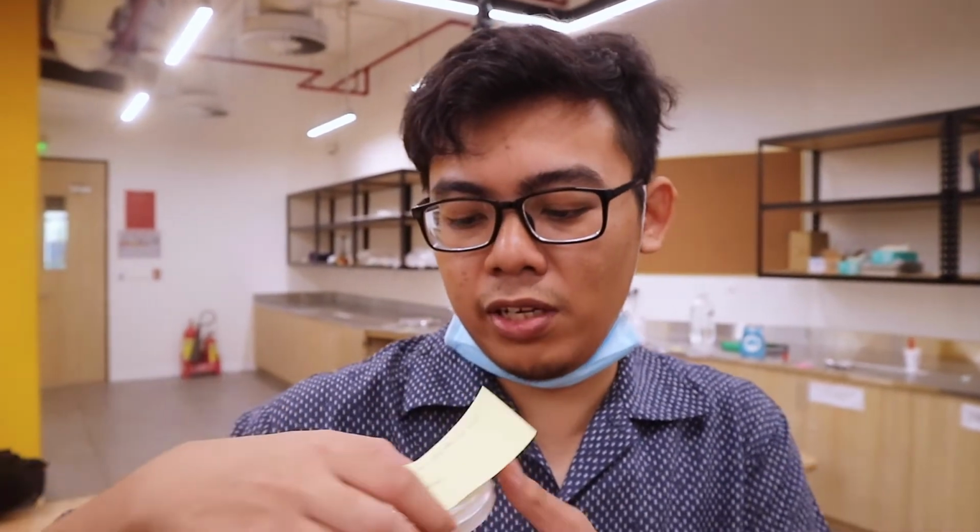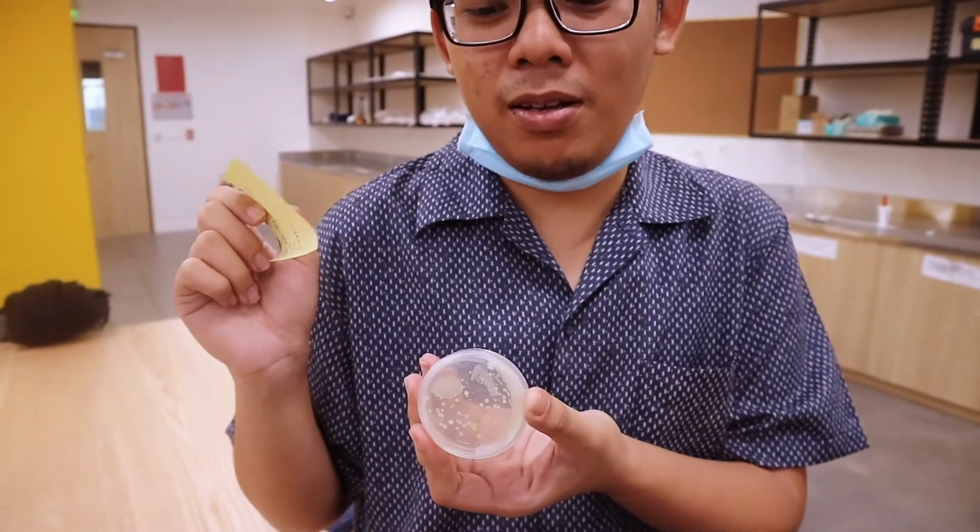May you summarize everything here? So another disclaimer is that we use a cotton swab to collect the samples, and maybe our streaks are not even among the plates, so it may affect the distribution of these colonies on these plates. But one thing for sure is there are more than one kind of bacteria found on these places, and generally it looks scary. There's a lot. Just from a single swipe, you see there's a lot.